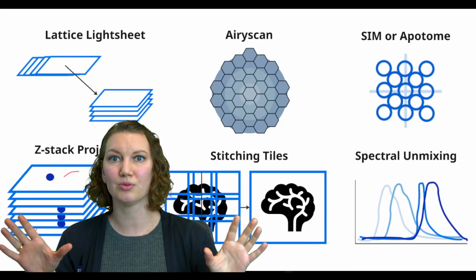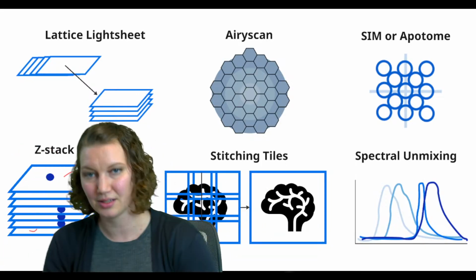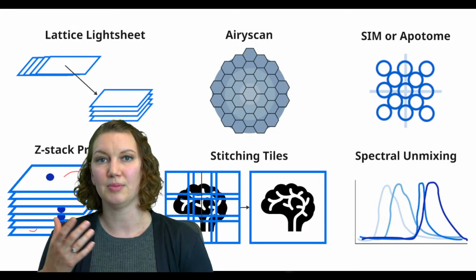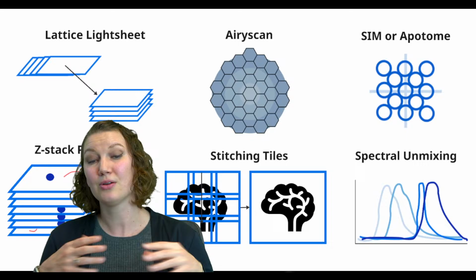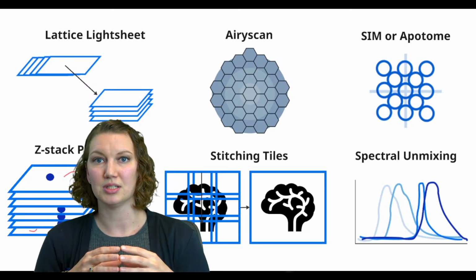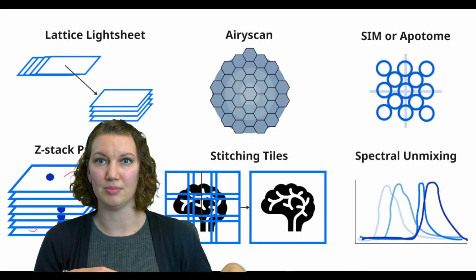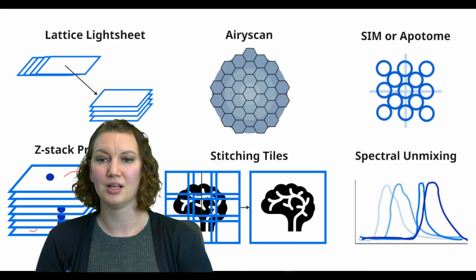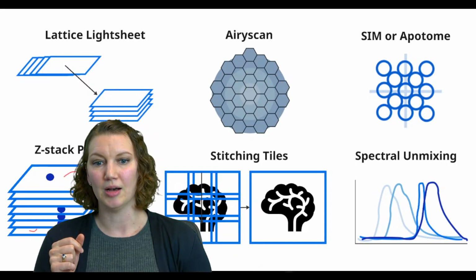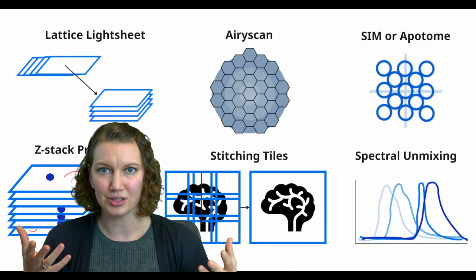So it's really, really powerful as a tool, direct processing, which is what we call it here. The way that it works is we set up, and now you can actually do it on the same instrument that you're acquiring on. But initially it used to be something that you would have to port over to an offline PC. There's multiple ways to do it now, and I'll talk a little bit more about the different software versions in a second. But first I think we should look at what does this actually look like, right?